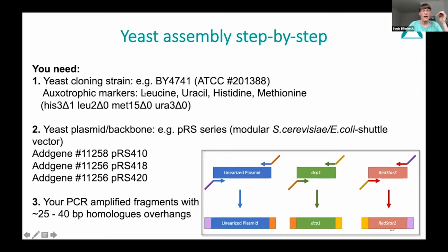That means single genes of the biosynthetic pathways of several amino acids and bases are deleted, such that you can bring them back in the plasmid and then select for the ability to grow in a media that lacks these amino acids.